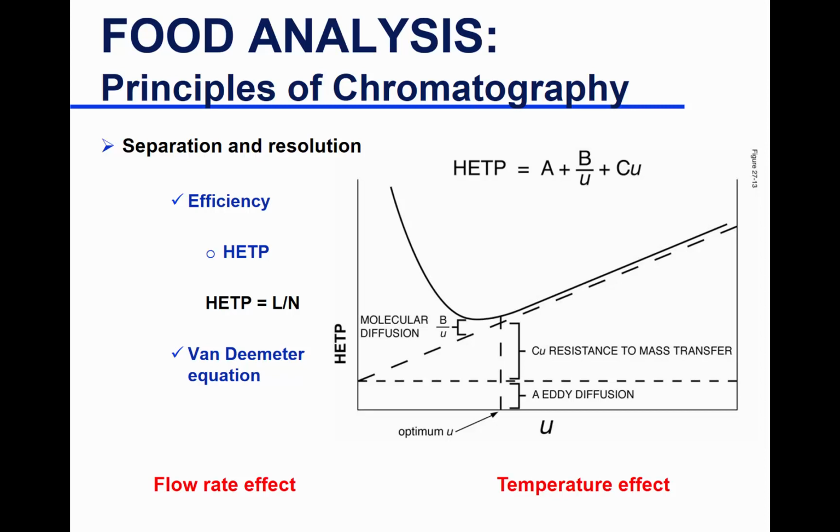If it diffuses, then your band grows from this to this. Then your sample is distributed like that, instead of staying a thin line, a thin band, and going in and out and moving down as a thin band. This will result in a really wide peak. This will result in a sharp peak. Yeah? Good. Any other questions?